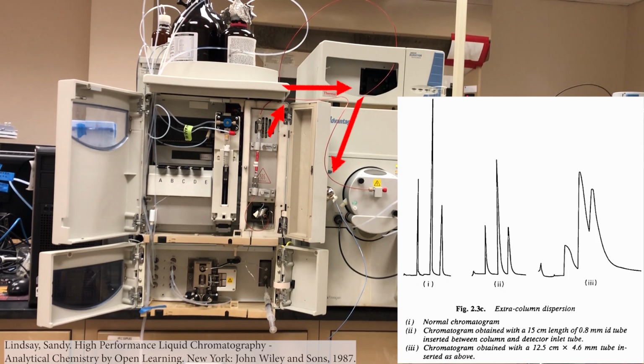So a quick note here, this tube that I have right now running out of the LC and the detector is really too long.